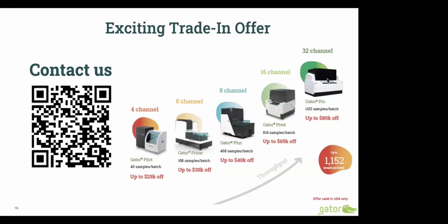How do the anti-VHH sensors work, and what was attached to the sensor and how they were developed? Sure, I can take that. These sensors are coated with a cocktail of monoclonal antibodies against VHH from different camelid species. Even though it's a cocktail, it's made from monoclonal antibodies, mixed in a carefully controlled ratio. That's what gives it a wide species range. It helps to immobilize VHH from several species. Several lots of this cocktail were tested, and we've seen it's very consistent from lot to lot because of the carefully controlled ratios of the monoclonal antibodies.